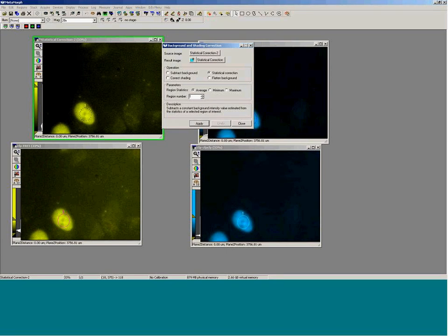And then our source 2 is going to be the double labeled YFP, in this case. So it's corrected FRET divided by acceptor image. In this case, I'm dealing with 16-bit images, so my results I want to be 16-bit.